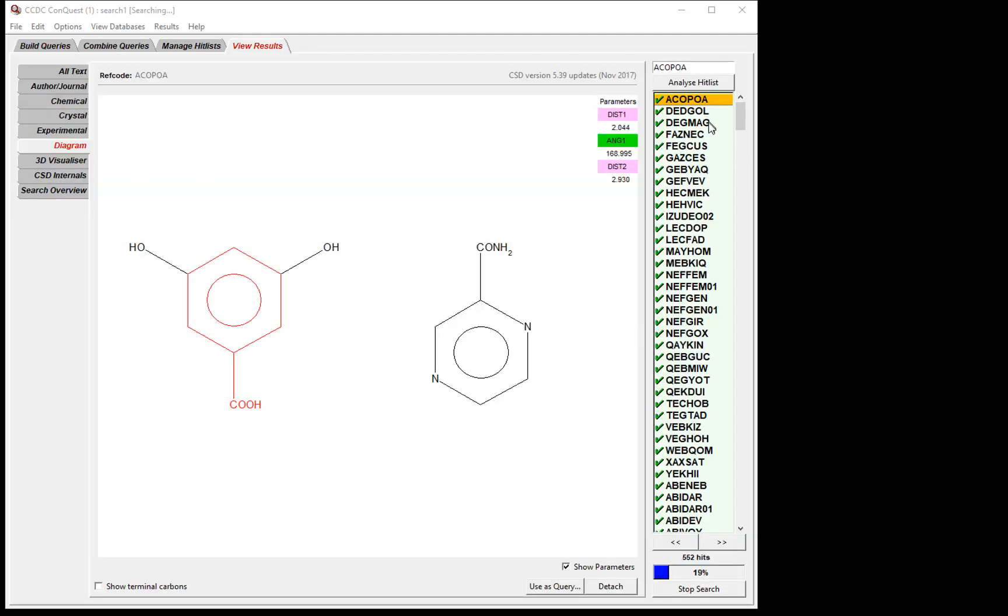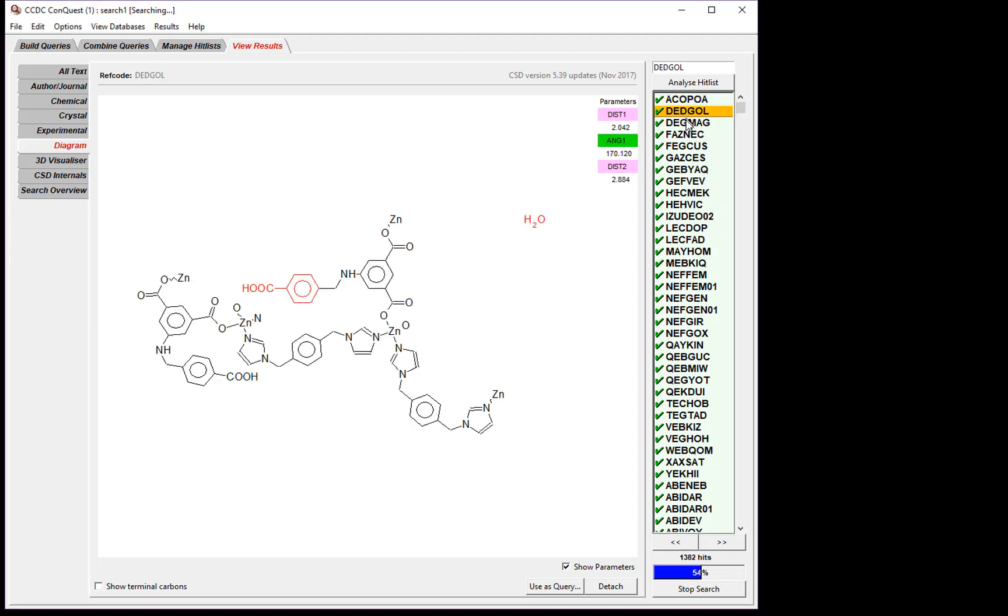You'll see that the hit list is populated with the ref codes of the entries that match the search. We can scroll through one by one, and we can see in red the fragments which match the search criteria, and the parameters returned by the search.